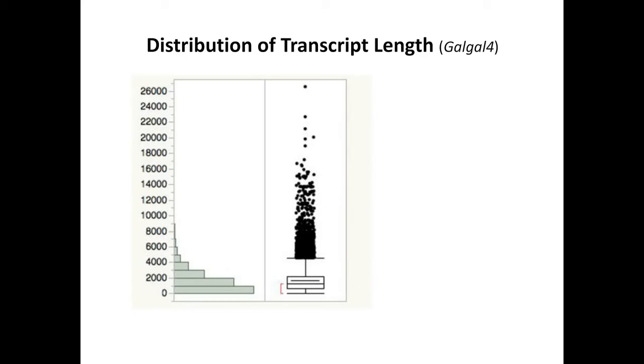So now you are comparing sequencing 100 base pair instead of 2,000 base pair. So you can see how much saving there will be if we can just focus our efforts on a small piece of the RNA. So this basically shows the difference between 3' RNA-seq and the conventional RNA-seq method.